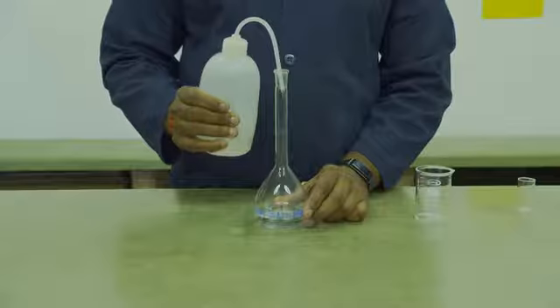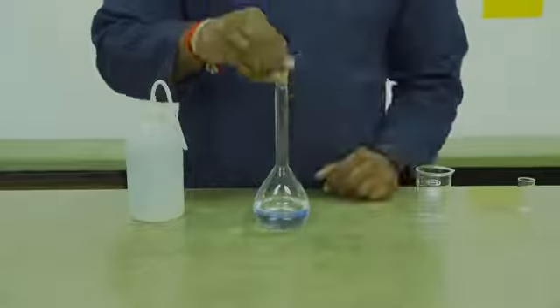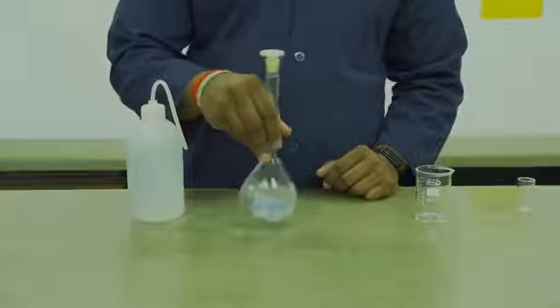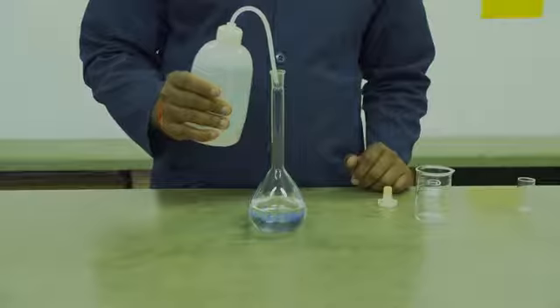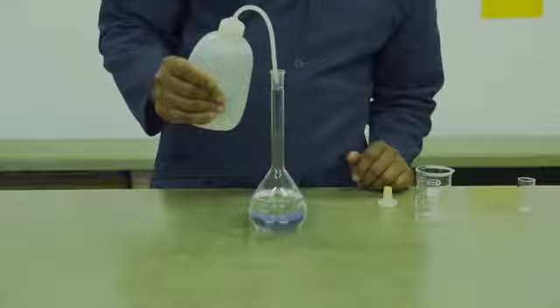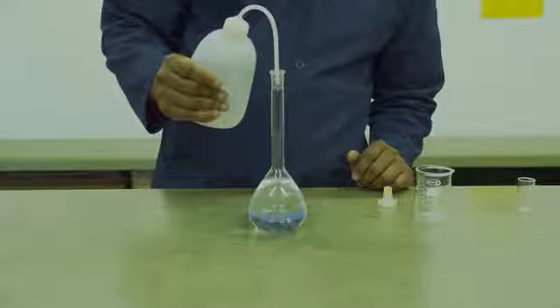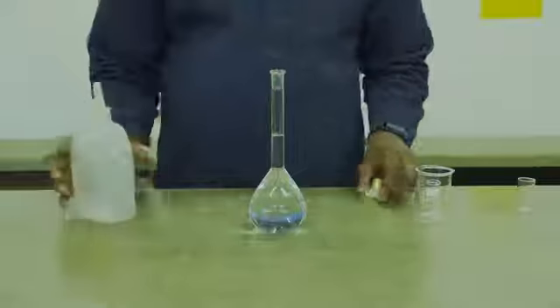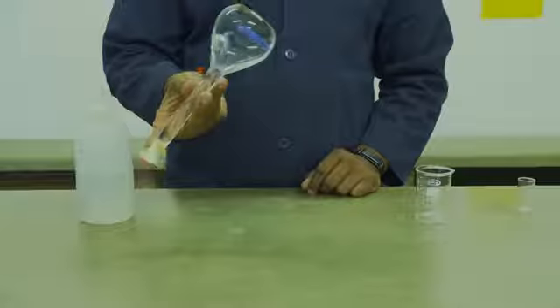You will then fill up the flask halfway with deionized water. Stopper it and swirl it to dissolve the rest of the liquid. Once dissolved, top it up to the mark with deionized water. Make sure that you don't overshoot the graduation mark. You are then going to stopper the volumetric flask and invert it ten times to ensure that the solution has homogenized.